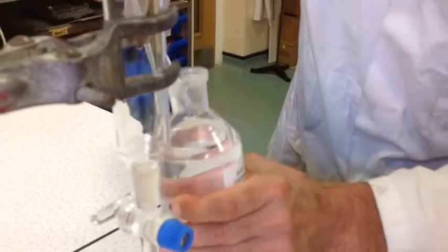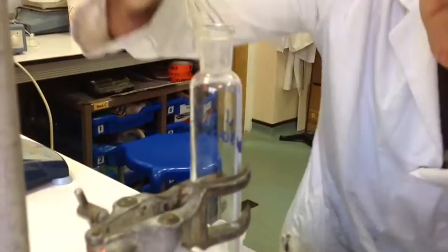Okay, I'm then going to add an equal volume of sodium chloride. An approximate equal volume, doesn't have to be exact.